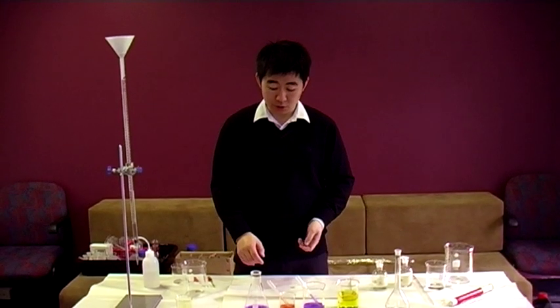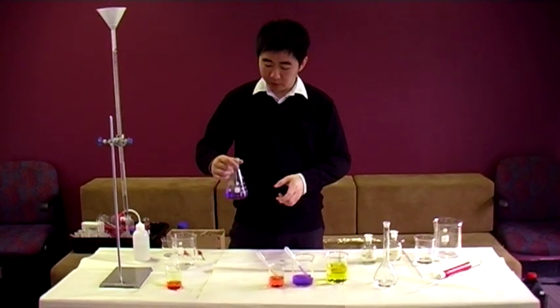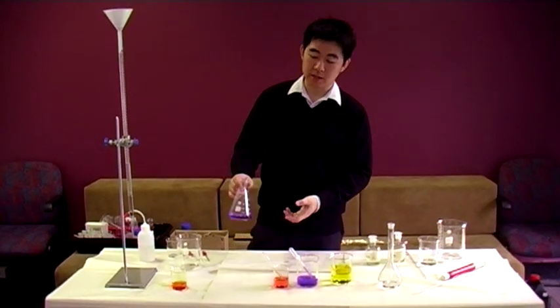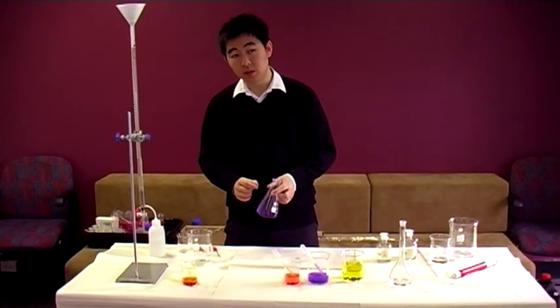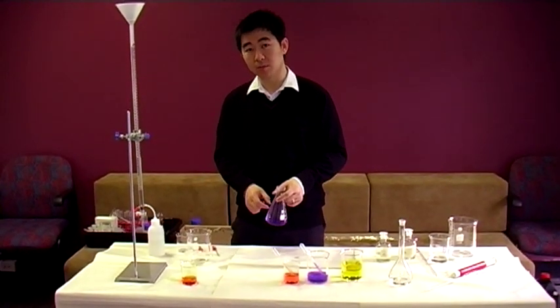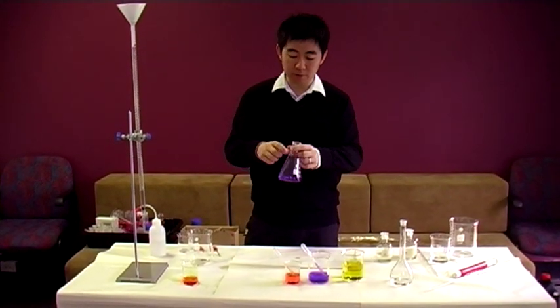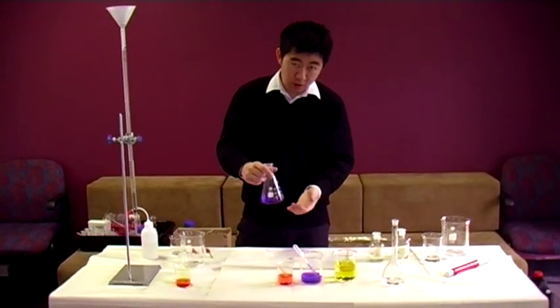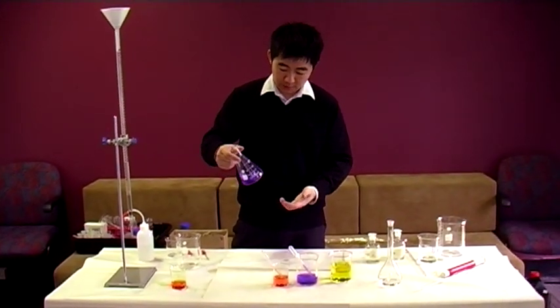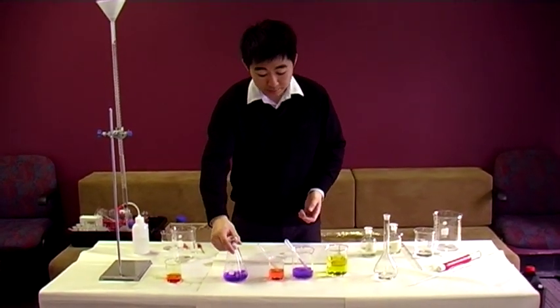The purpose of this video is to show you what the equivalence point looks like, what the colour change of an indicator looks like at the equivalence point. A single drop, if you do your titration properly, at the end point rather for your indicator, is enough to completely change the colour of the solution in the flask — the mixture of your titrant and your analyte.